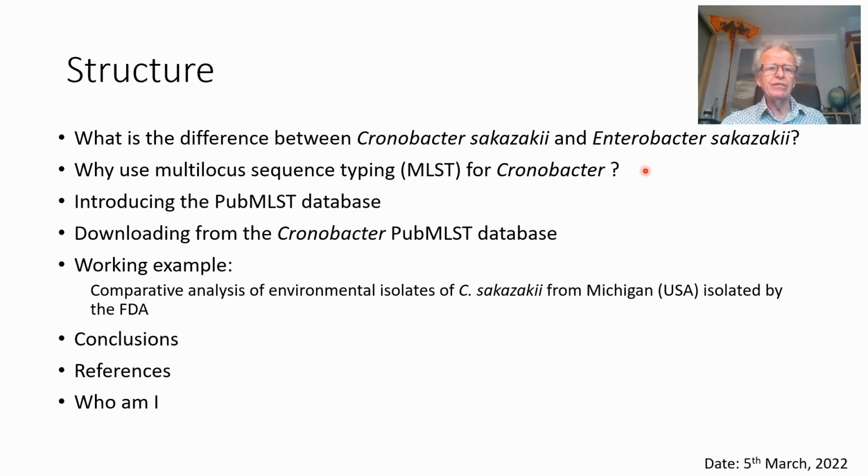And that's going to introduce us to the internationally available PubMLST database, which, as I said, I curate. And to show the usefulness of that database, I'm going to show you how you can select all the isolates from, let's say, America, and how you can look at all the genomes that have come from Michigan or any other area of the USA that you have an interest in. Then we're going to come to some conclusions, then give you a few key references, about 5 of them, and then just going to explain who I am.